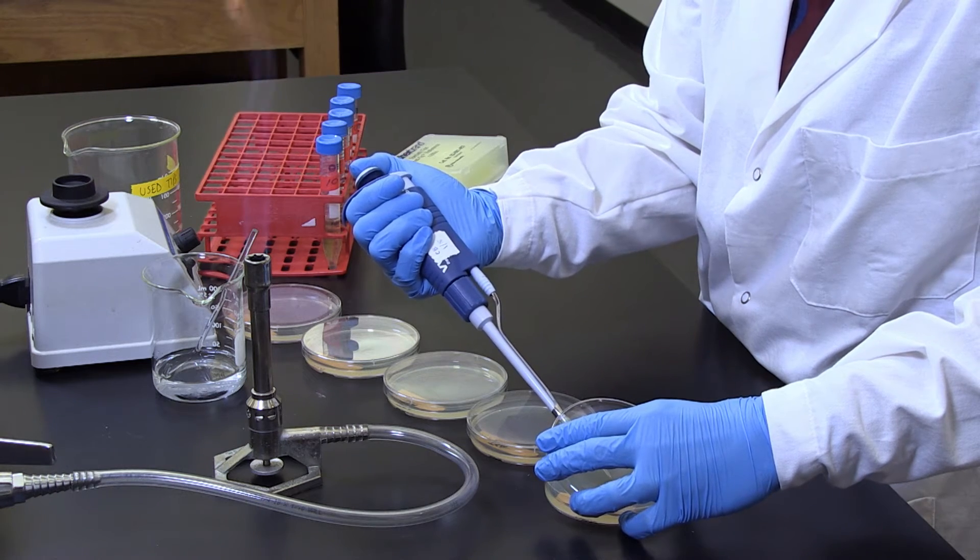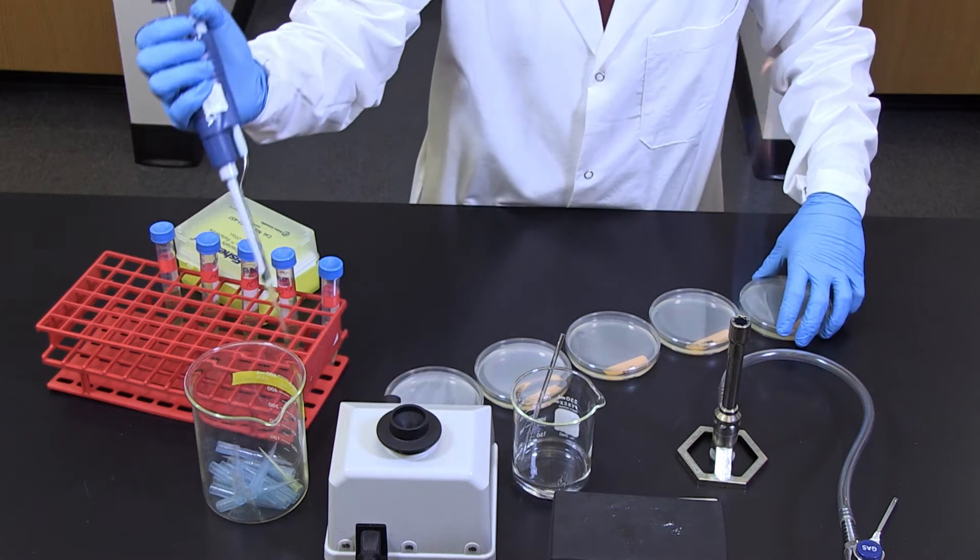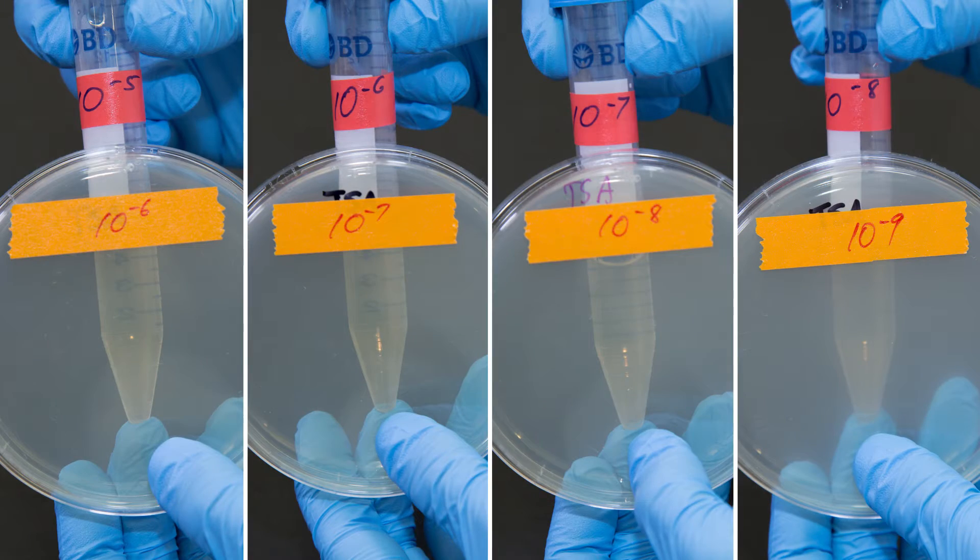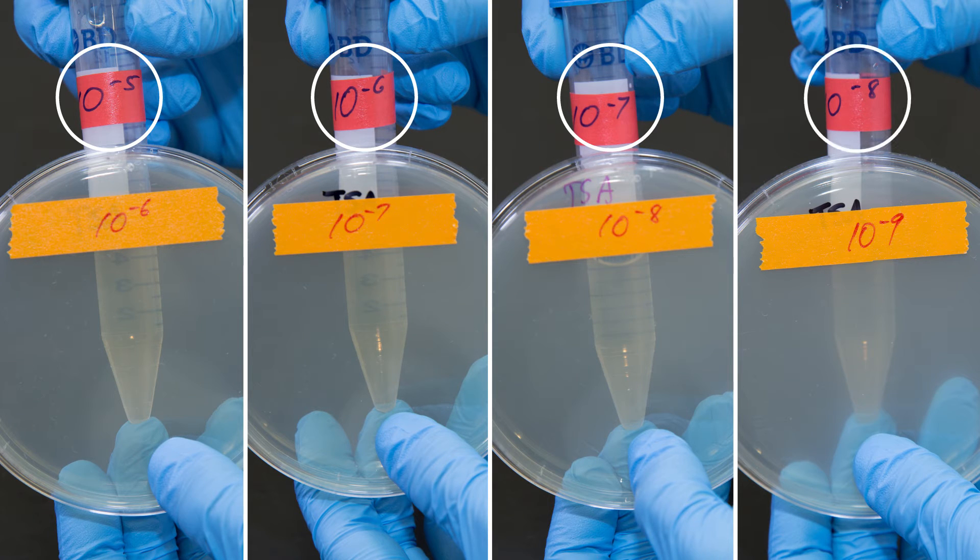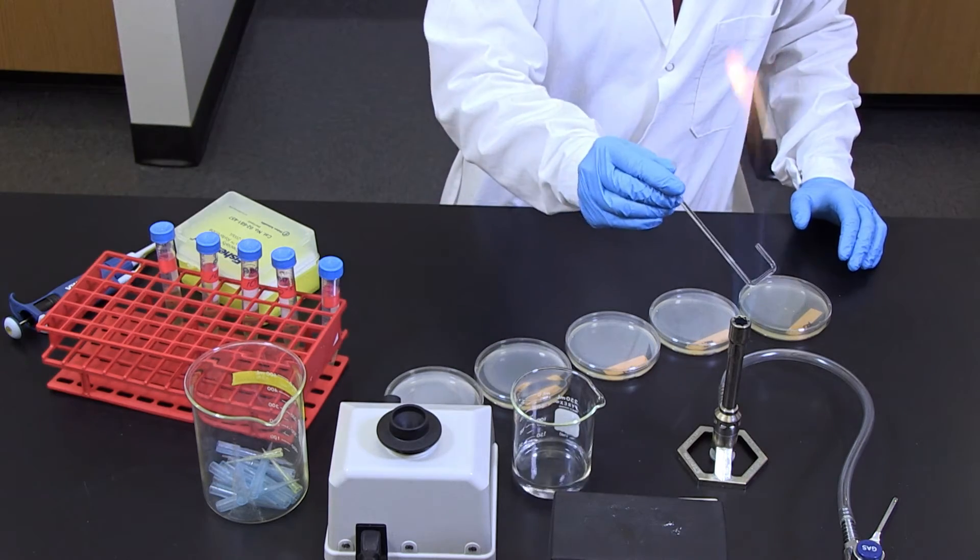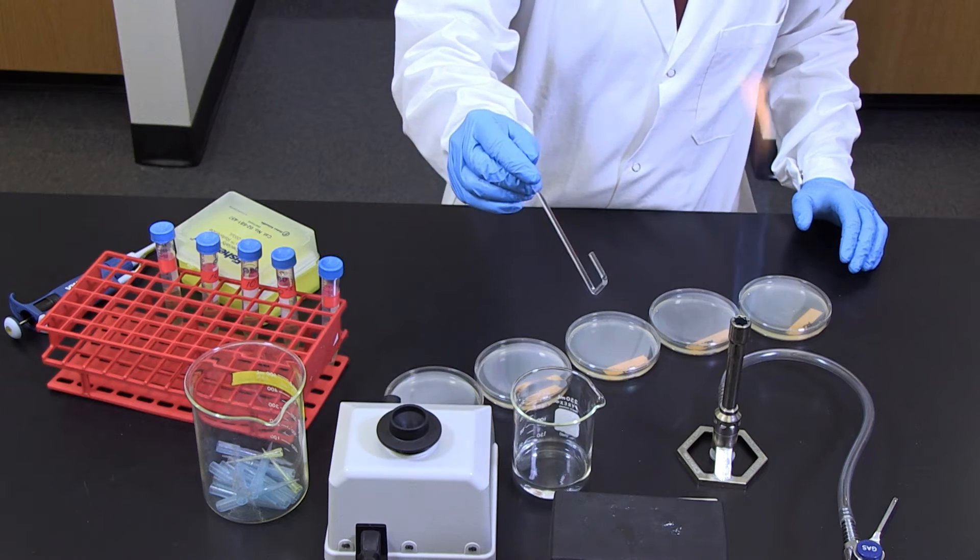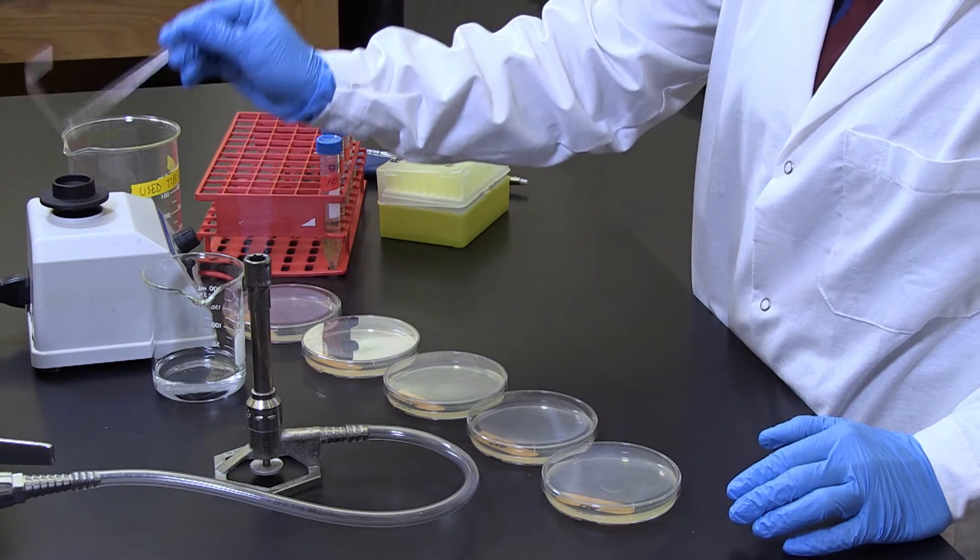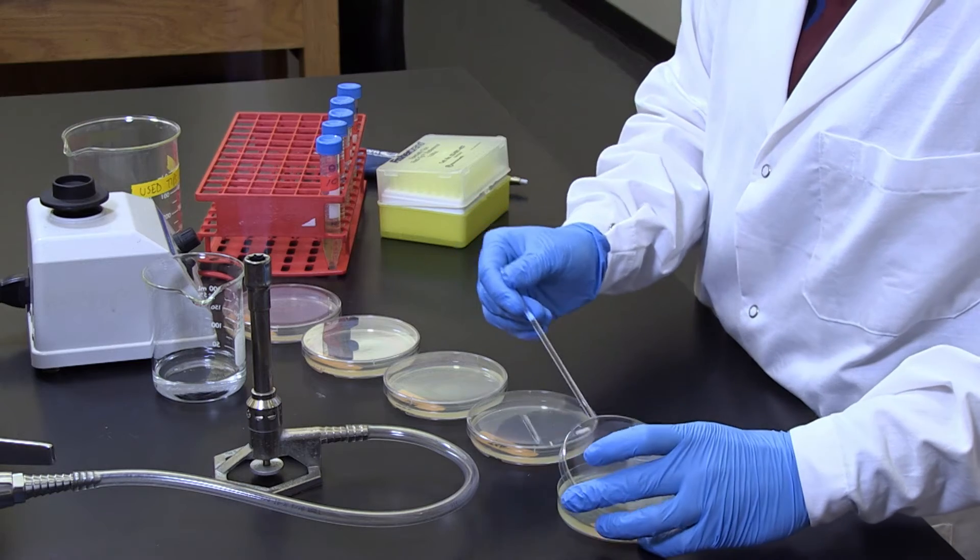Change the pipette tip and continue to transfer 0.1 milliliter of the diluted samples from ten negative five, ten negative six, ten negative seven, and ten negative eight test tubes to the agar plates labeled ten negative six, ten negative seven, ten negative eight, and ten negative nine, respectively. Apply aseptic technique to spread the bacterial diluted aliquot evenly on the entire surface of each of the agar plates just prepared using a sterilized cell spreader.